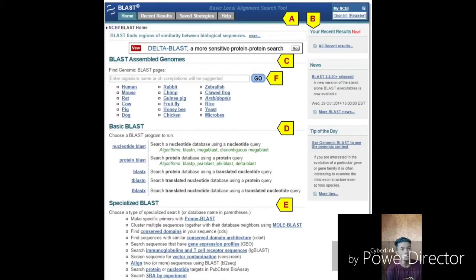Next is the BLAST homepage and selected search pages. So I will introduce the BLAST homepage and form elements or functions of selected search pages. As you can see, there are a lot of arrow letters in the picture of the BLAST homepage. BLAST is a suite of programs provided by NCBI for aligning query sequences against those present in a selected target database. The NCBI BLAST homepage provides an access point for these tools to perform sequence alignment on the web.